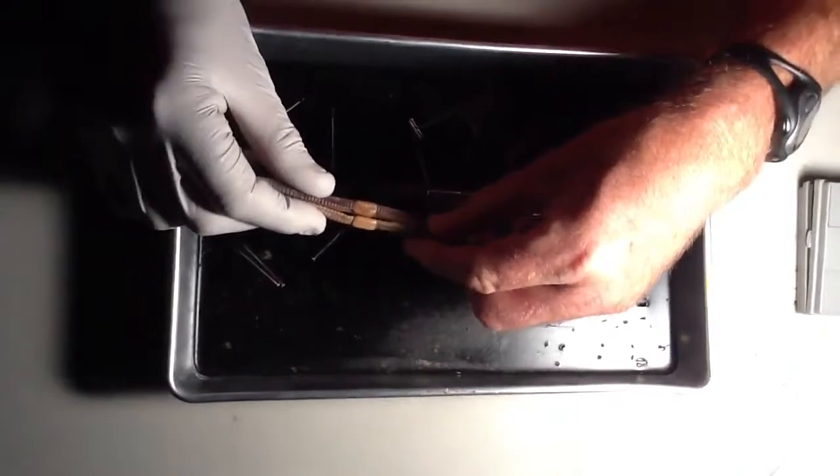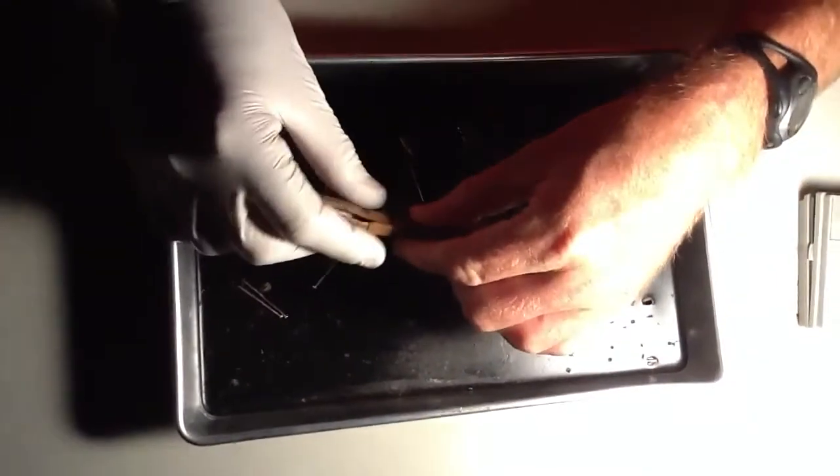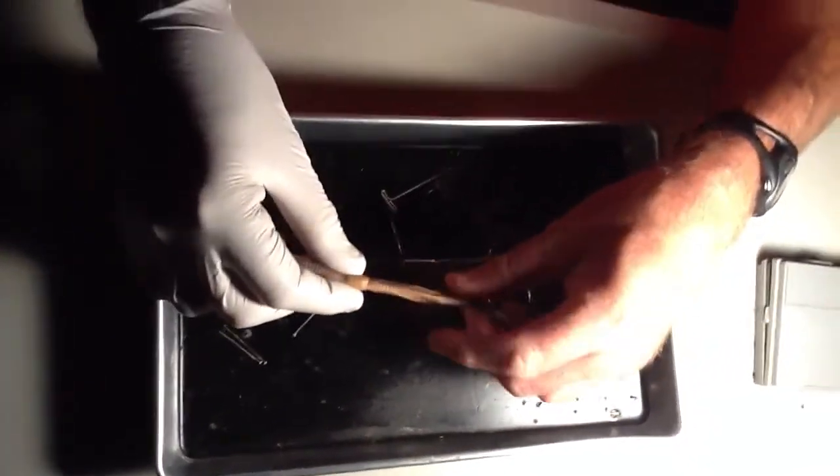Yeah, watch there. So when they mate, they actually go head to tail, kind of clitellum to clitellum, and what they do is some slime or mucus comes out, and they wrap around that area, and that lines up all their genital pores.